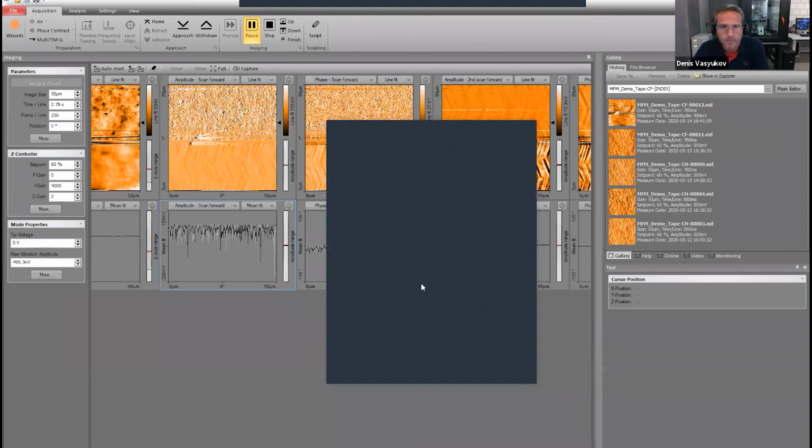With MFM, I think it will be a hard measurement. Certainly, you can position a sample here on the stage and attach electrical contacts to it and try to do that. But with MFM at room temperature, I think it's a hard experiment. Again, I would recommend low temperatures and quantum sensors for that rather than MFM. But maybe at low temperature MFM is possible, but not at room temperature.